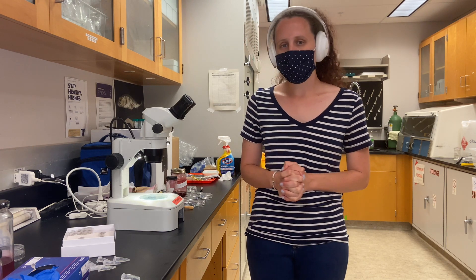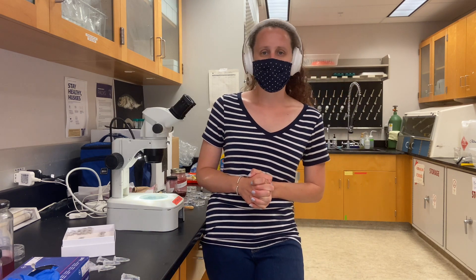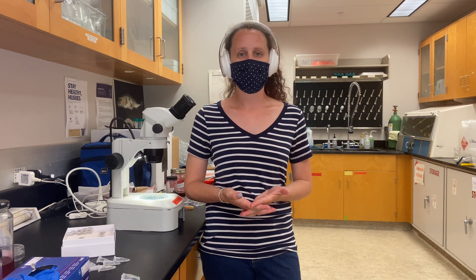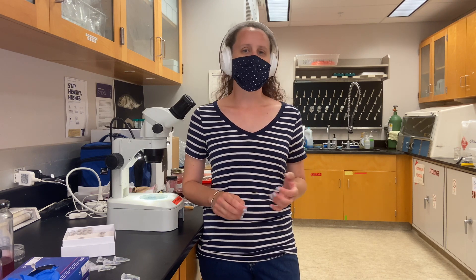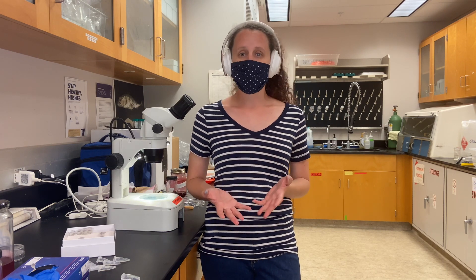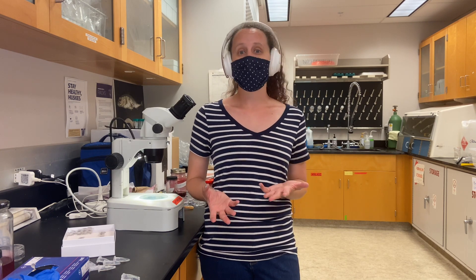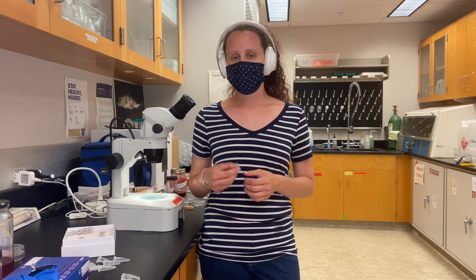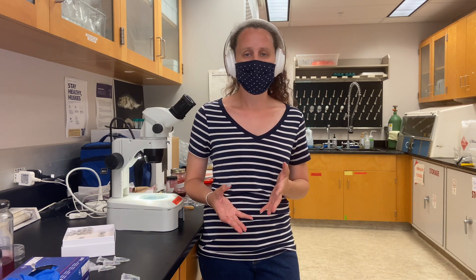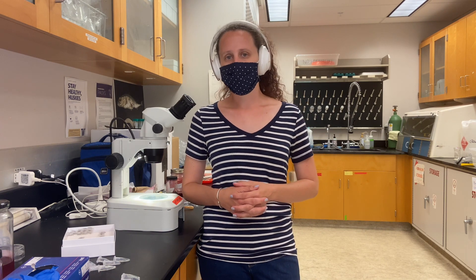It's really important to stain these parasites because it lets you look at their internal morphology, which is something you couldn't do by looking at an unstained specimen. It really lets you look at the different organs like the testes, the ovary, and the vitelline glands — organs you would not be able to see without staining. It also allows you to bring things into contrast with each other, so it helps you measure things better, and measurements are very important for identification.